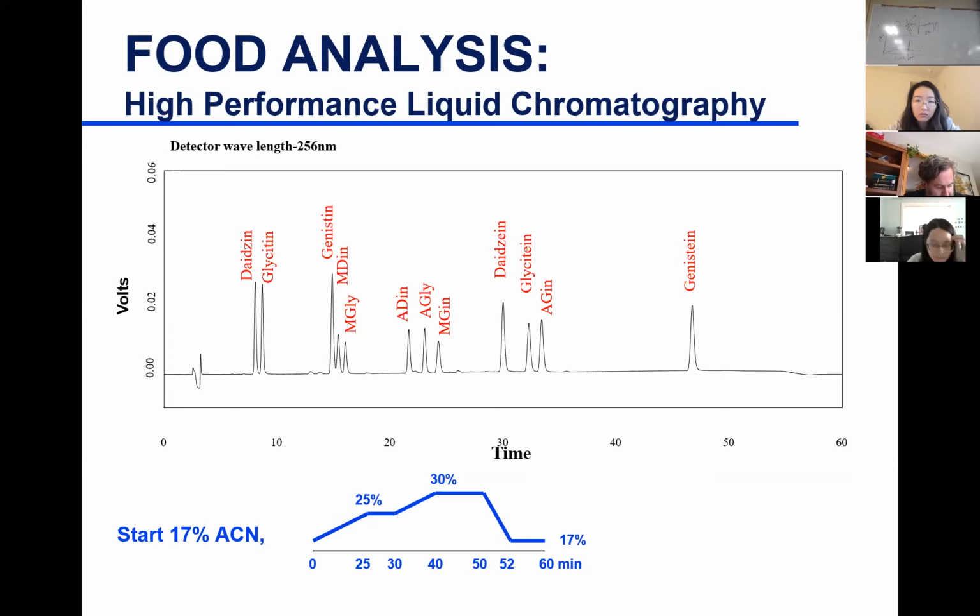So in reverse phase chromatography, the first peak or component is the most polar because it will not like to interact much with the stationary phase. It would like to interact more with the mobile phase, so it moves faster than the others. So the first component is the most polar and the last component is the least polar. These are all common questions that I would ask in a quiz or an exam.